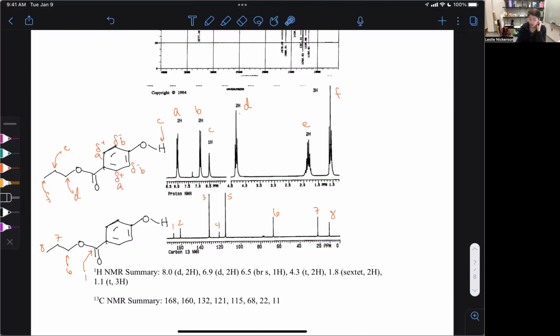So there's a couple things to keep in mind here. Carbons without H are the shortest. Carbons that have H's on them tend to be taller. So if you look at these ones that are all CH2 or CH3, we're going to use that as our one carbon line-ish.